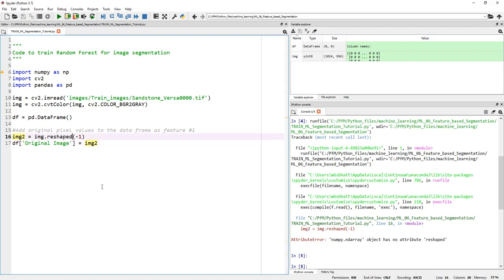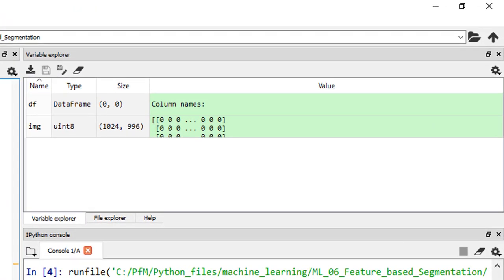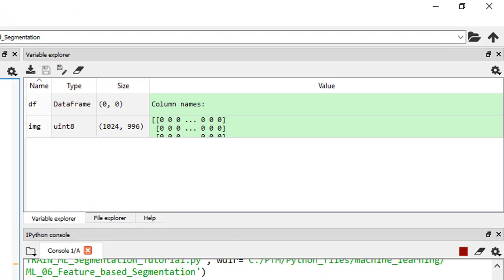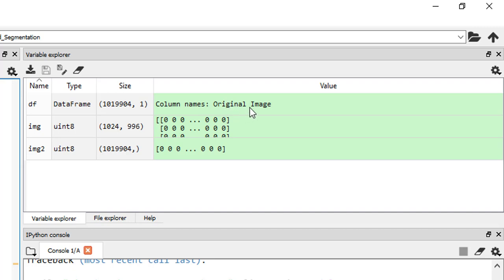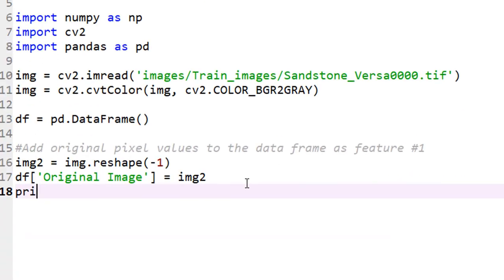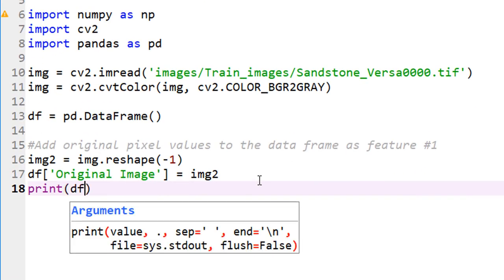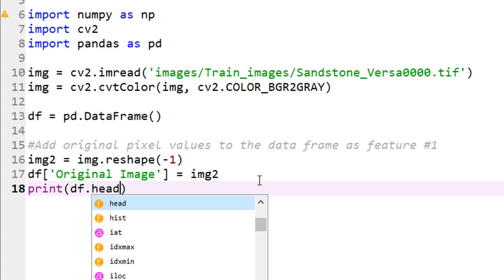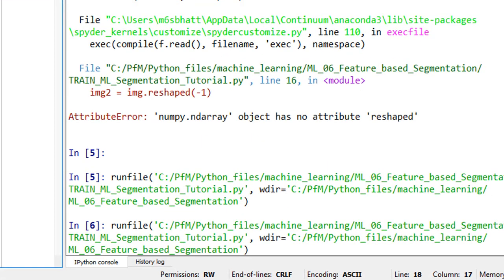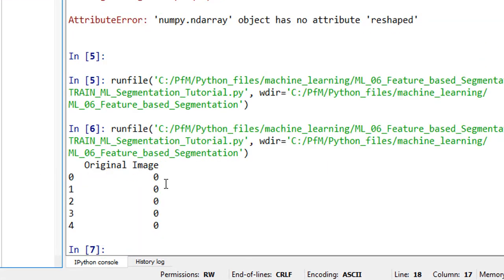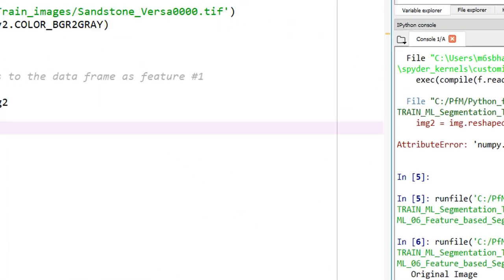Pandas is like Excel for Python. We have columns and rows. 'Original_Image' is my column number one. But this is a 2D image. How can I add that in one column? We have to unwrap it. I'm defining img2, which is img.reshape(-1). When I put minus one, that says reshape my image into a single column. Now I can add img2 pixel values as the row values for original image. Let me run this. There you go.